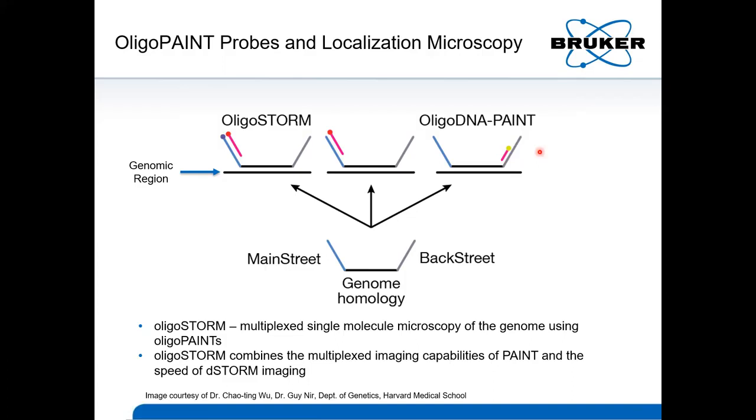The difference in the two methods being that oligoSTORM relies on blinking of the fluorescent molecule to generate localizations, whereas DNA-PAINT localizations would come from the transient binding of DNA onto the sample. Having both options available allows for the same region to be imaged twice if necessary.